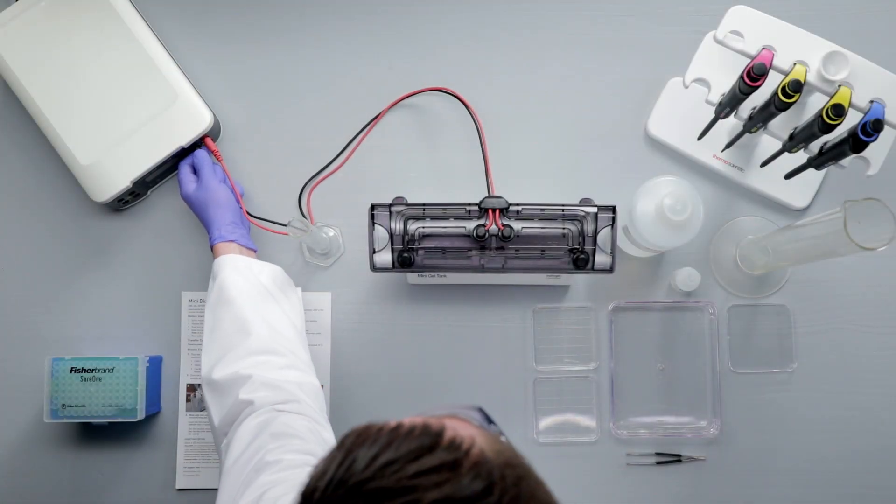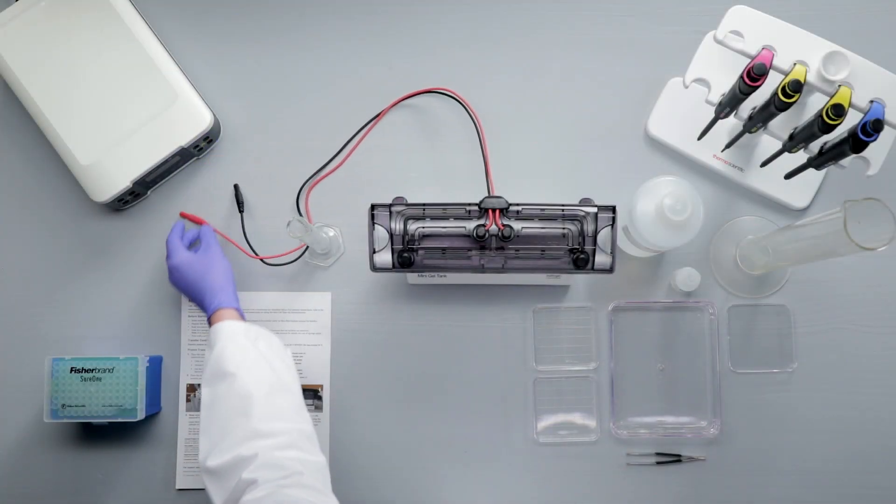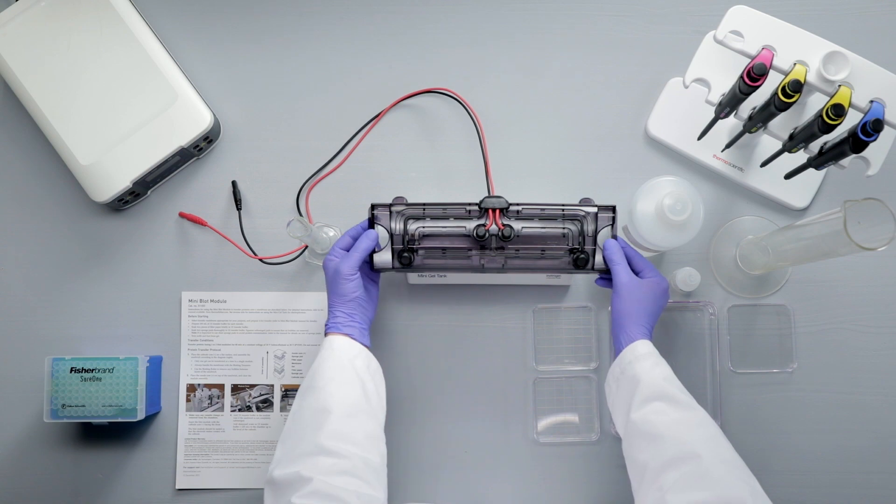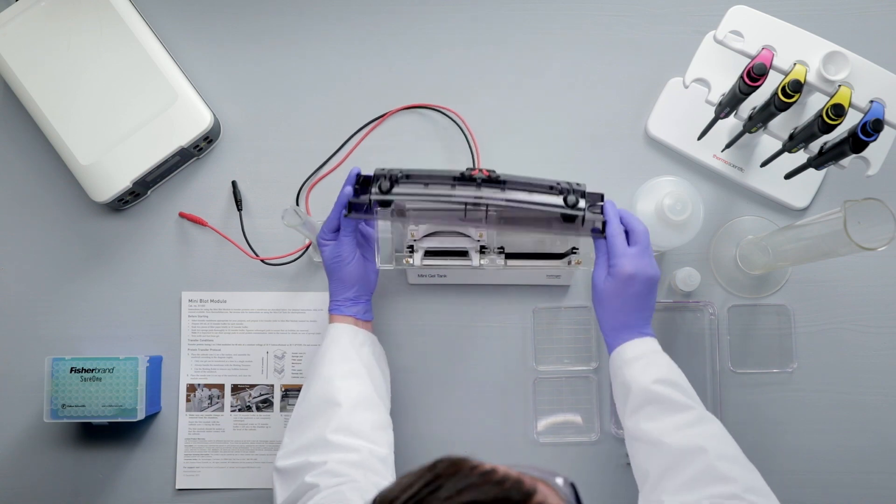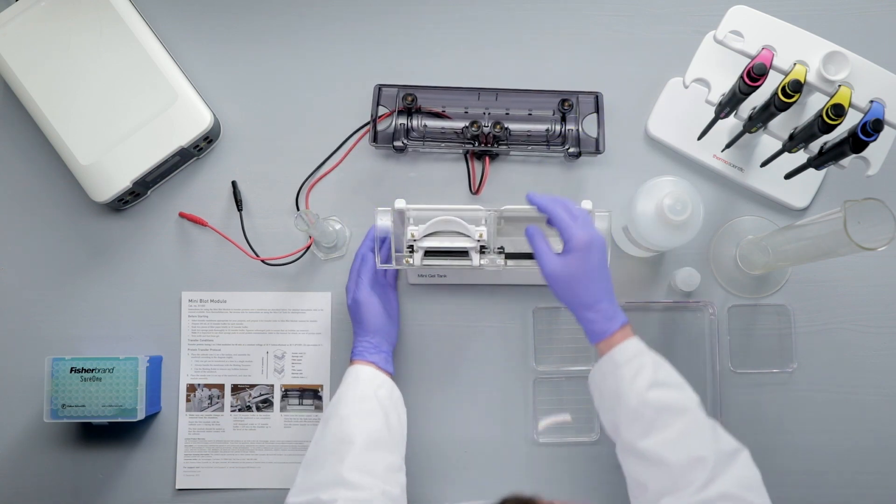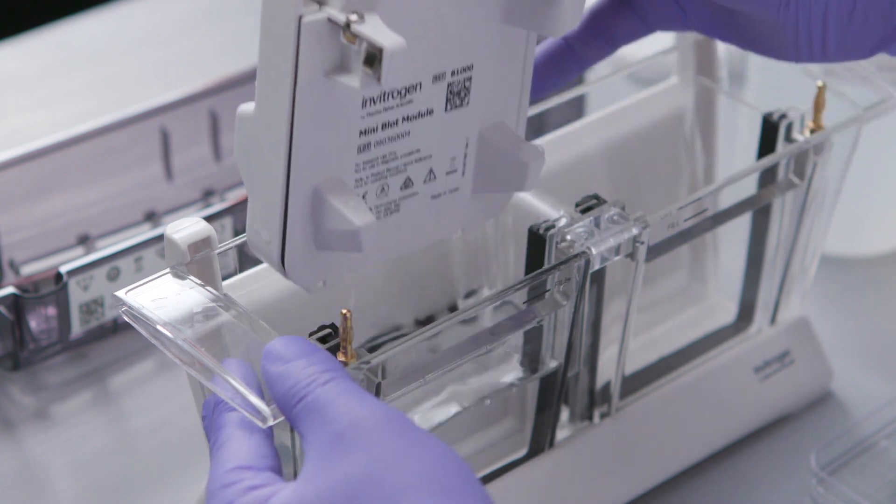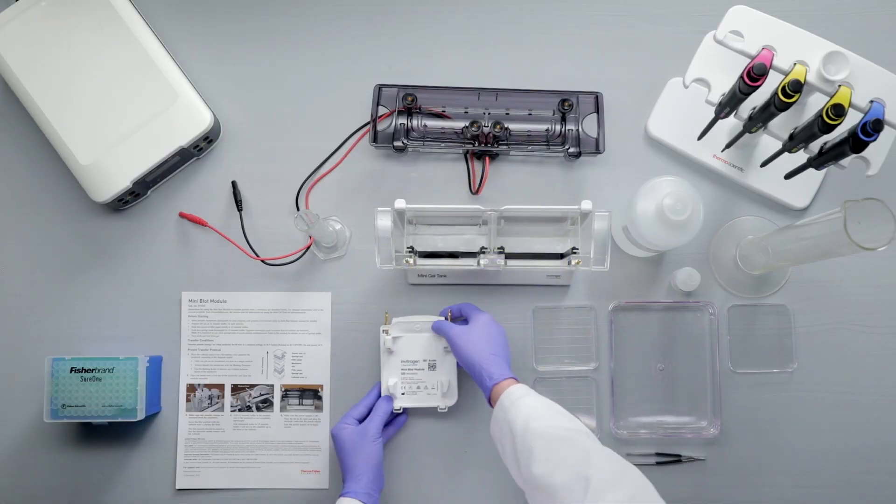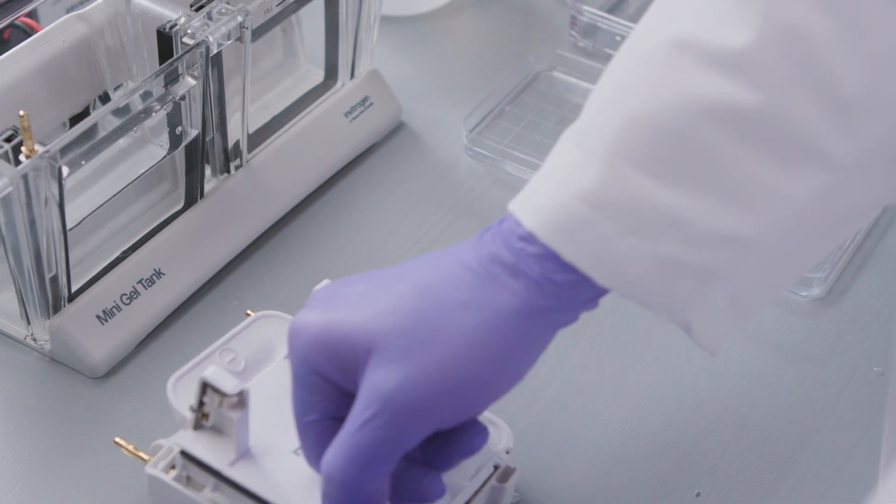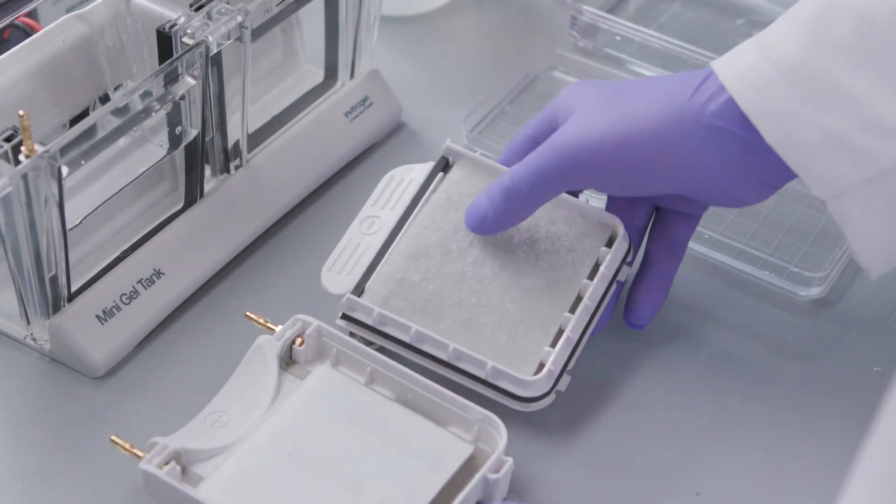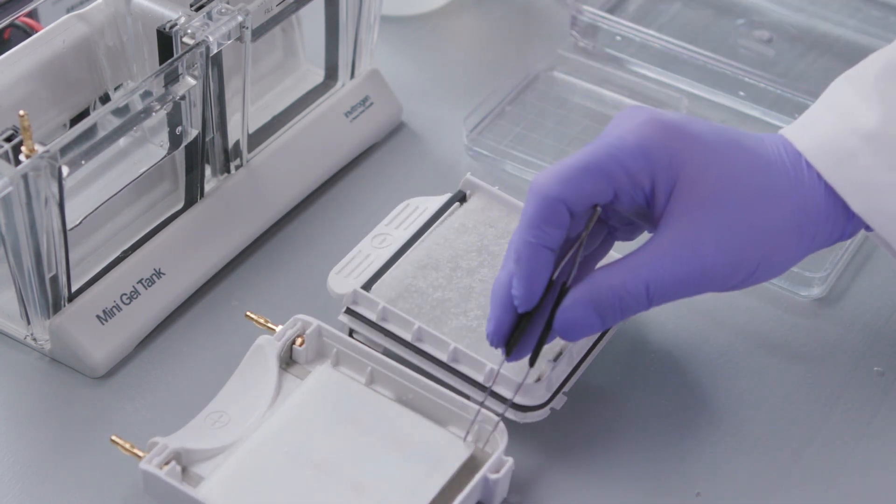After the transfer is complete, turn off the power supply, disconnect the cords, and remove the lid by placing your thumb on the tank handles and pulling the lid up with your fingers. Remove the module, pour out the buffer, and disassemble the module. Remove the membrane using tweezers.